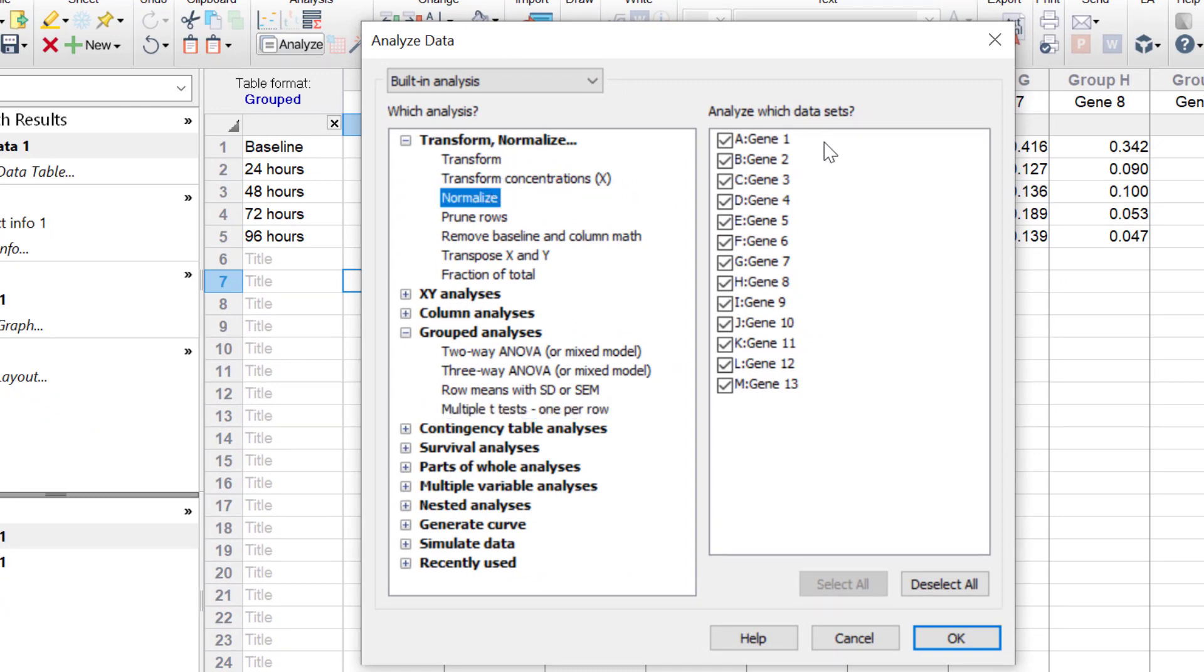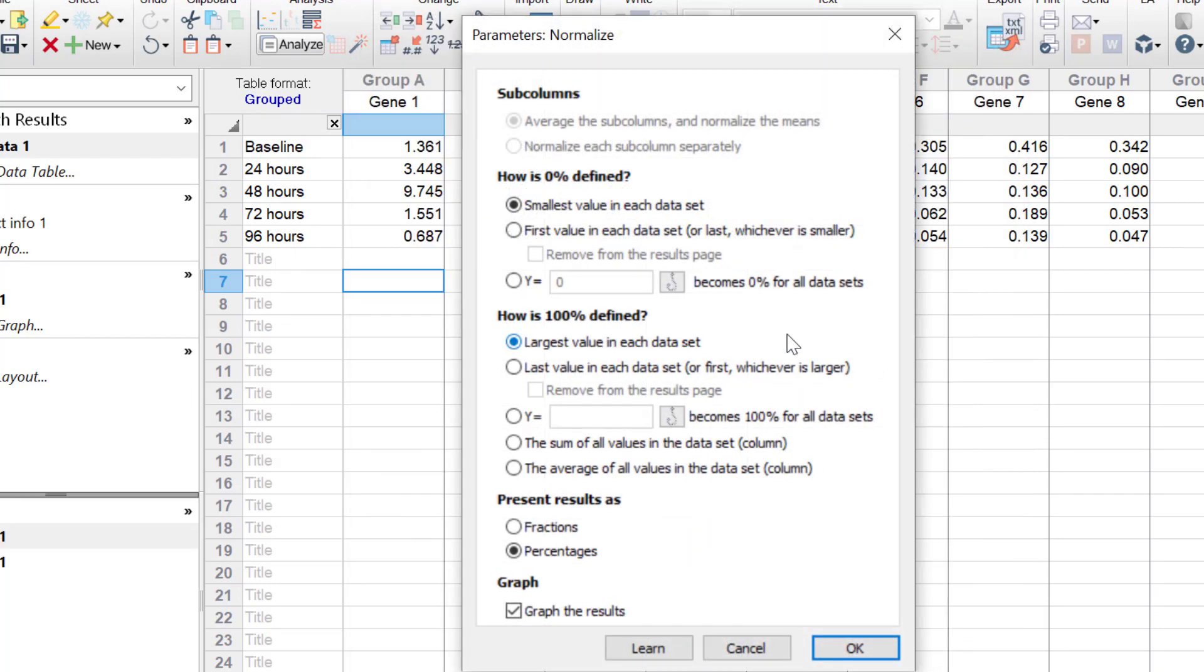I want to normalise all of my gene data sets, so I'll leave them all selected, and then click OK. This will open up the Normalise Parameters window. It's worth mentioning that each of these options here are discussed in more detail in a separate video tutorial.